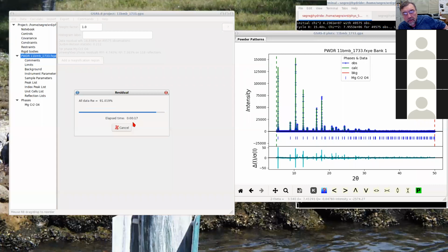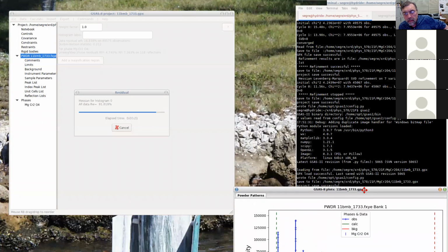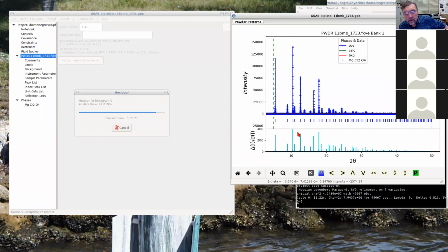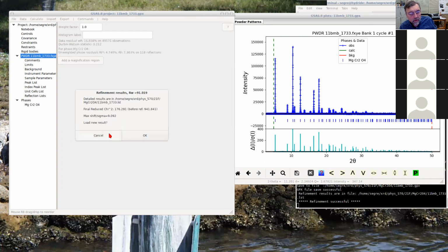This does not make me happy. Yeah, this is not great. Okay, it's easy enough to start fresh. There's something that's not quite working here. So I'm going to cancel this.